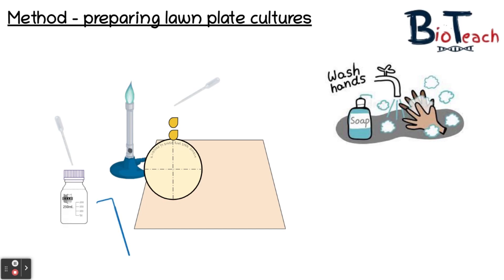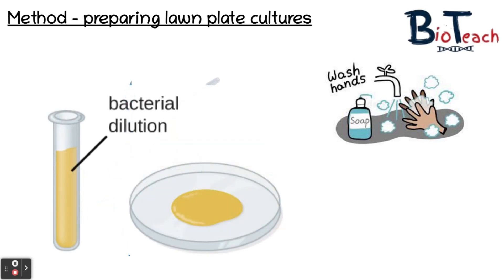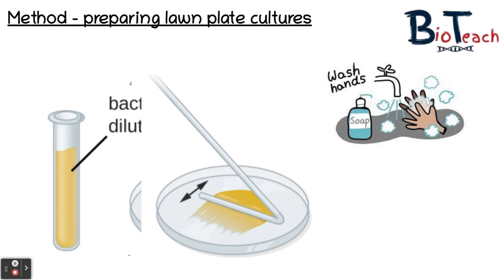The sterile spreader you were provided with — you may need to unwrap it if it's in plastic wrapping. Facing the Bunsen, lift the lid of your agar plate with your non-dominant hand and use the spreader to spread the culture around the entire surface of the agar. You have to do this very lightly — agar is very fragile, so if you press down too hard you will break the agar surface, which will make it very difficult to grow the bacteria on that lawn culture. The agar surface needs to remain smooth, so spread very gently.